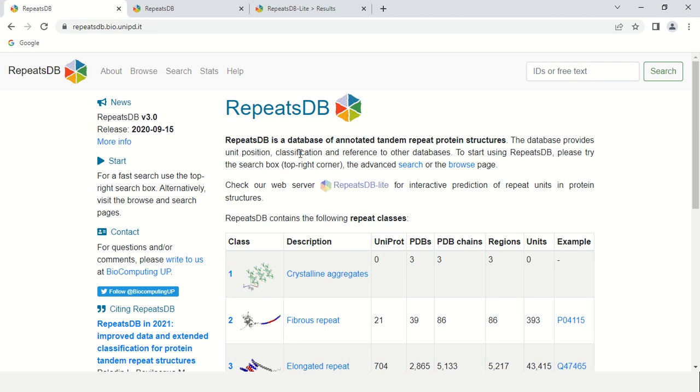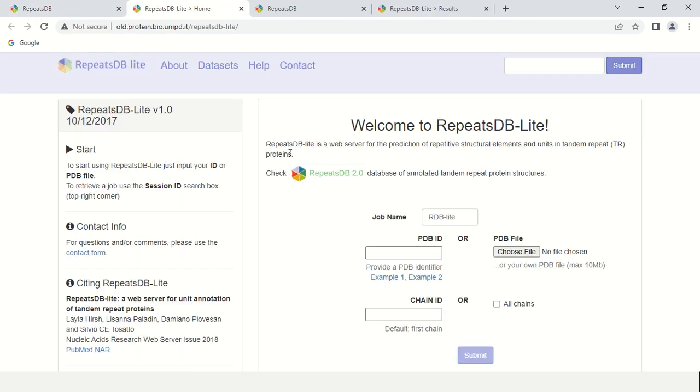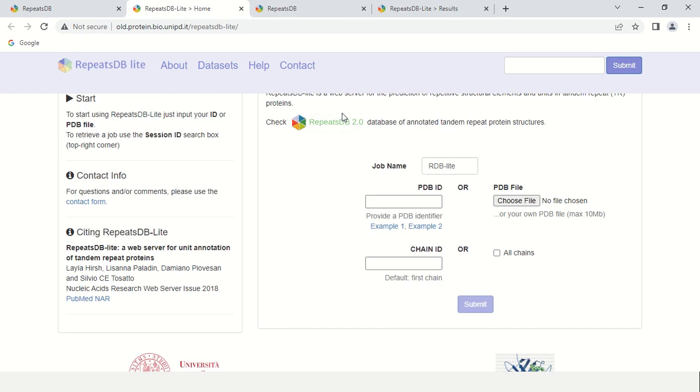In order to know the tandem repeats in your sequence, just click this option, RepeatsDB light. As you click here, a new window has been opened. Here you can search by PDB (Protein Data Bank ID). You can use PDB ID or directly choose the file, but it should be in PDB format. You can also use the chain ID.